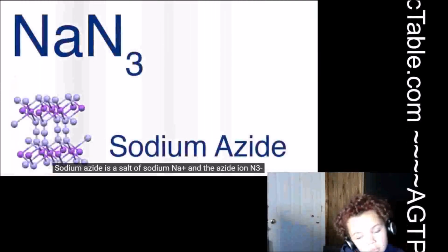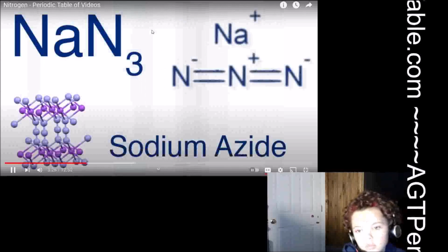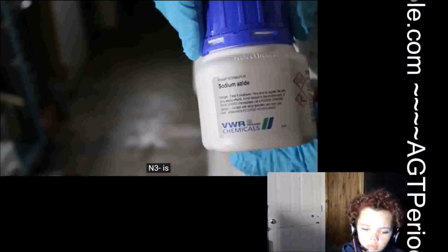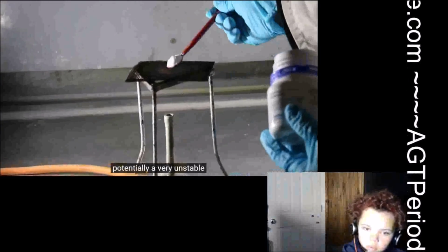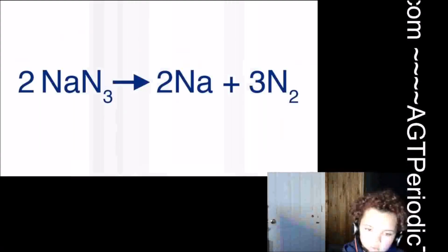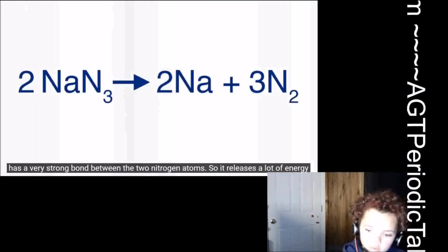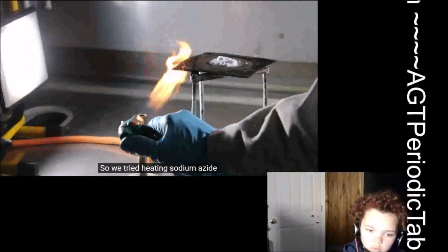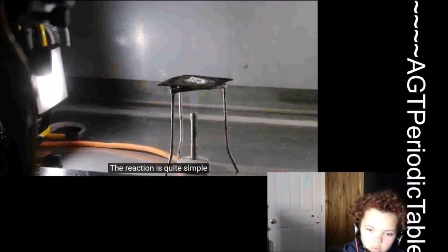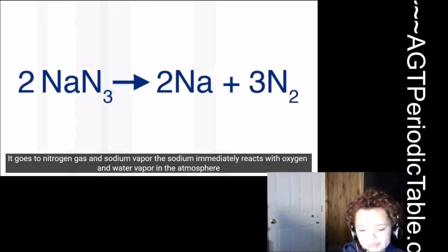Sodium azide is a salt of sodium, Na+, and the azide ion, N3-. Azide comes from the French name for nitrogen, azote. N3- is potentially a very unstable anion. If you heat it, it can turn to nitrogen gas. N2 has a very strong bond between the two nitrogen atoms, so it releases a lot of energy. So we tried heating sodium azide. The reaction is quite simple. It goes to nitrogen gas and sodium vapor. The sodium immediately reacts with oxygen and water vapor in the atmosphere.